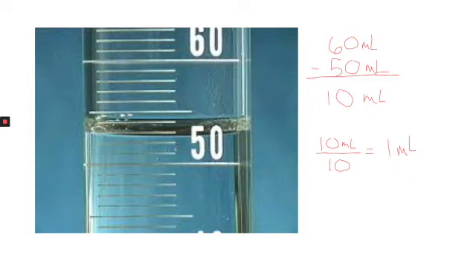And you might wonder, why don't they just put that here? It's because it would cause a lot of clutter and make it hard to read. In fact, you can see the 50 alone for us to see it has this big line it's sitting on, plus it's next to these three littler lines. So what this verifies is what I said earlier. Each of these lines is plus 1 milliliter. So if this is 50, plus 1 makes this 51, 52, 53, 54, 55, 56, 57, 58, 59, 60, and by doing that, we confirm our math is right.